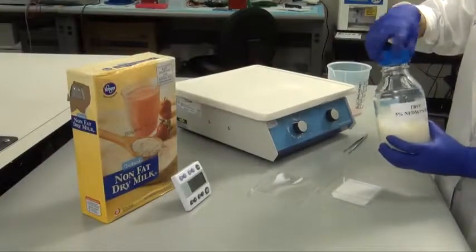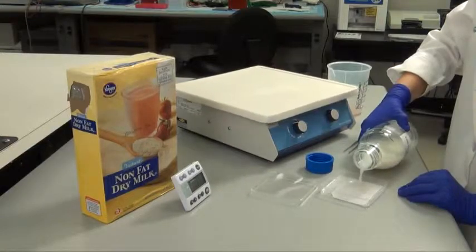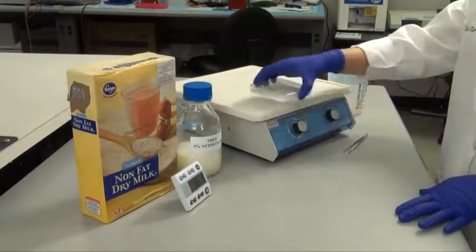We need to block all areas of the blot which do not already contain protein. This will prevent nonspecific binding of the antibodies and reduce overall background signal. Common blocking buffers include 5% non-fat dry milk, or BSA, in a TBS tween solution.